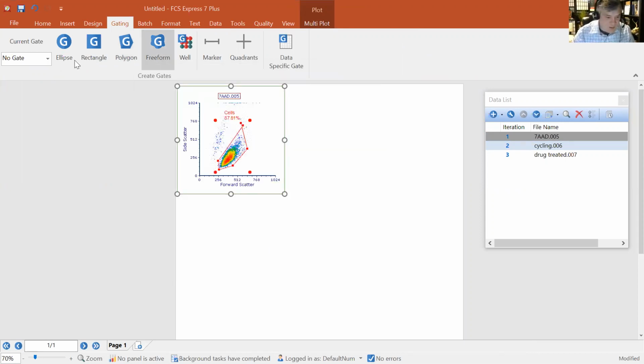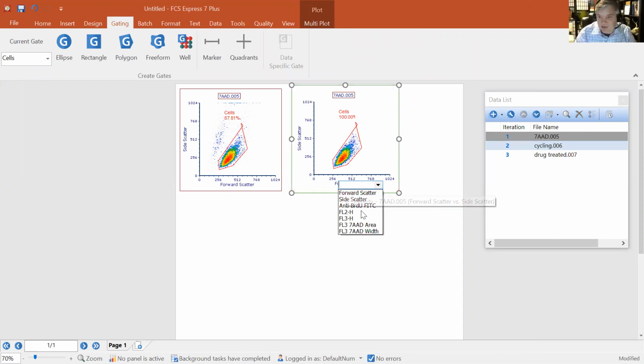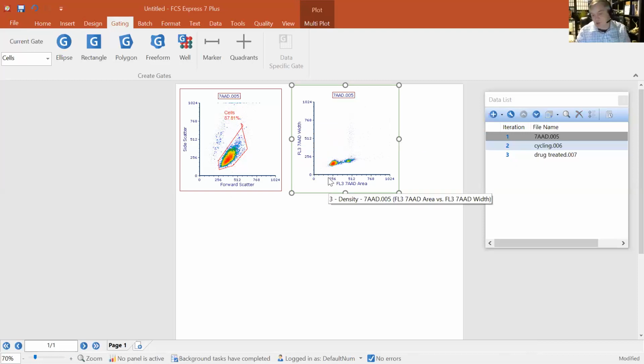And again, importantly, when we're working with this cell cycle data, we want to get this cleaned up as much as possible before we analyze it. I come from the camp where I like to get my data cleaned up before I analyze it, instead of relying on background and aggregate debris tools. Again, they're both valid methods of doing this. This was just the way that I've been trained.